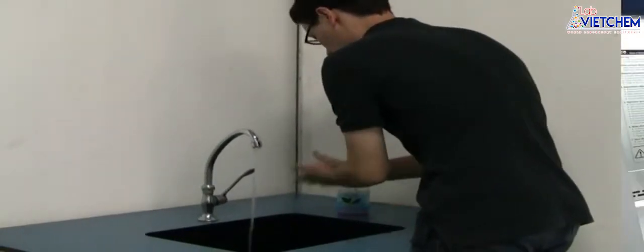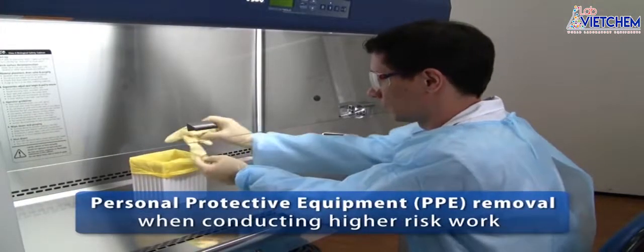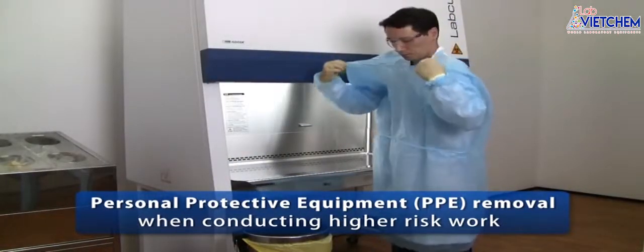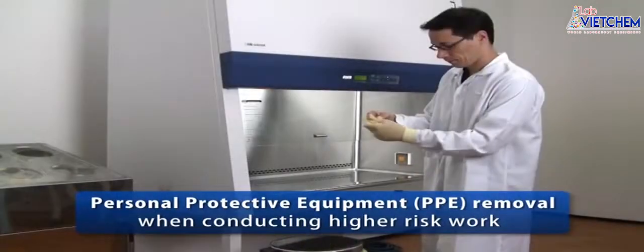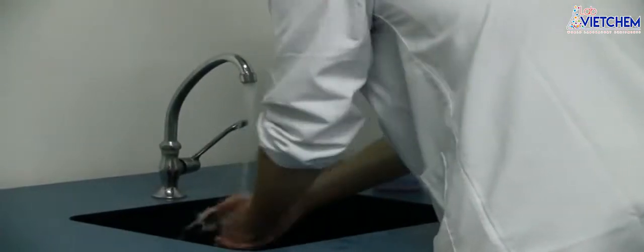If you perform higher risk activities in the cabinet in the biosafety level 2+ or 3 laboratory, remove your outer gloves and then your gown, being careful not to contaminate your skin or street clothes. The outer gown and gloves should be disposed of as biomedical waste. Wash your hands thoroughly with germicidal soap and water.